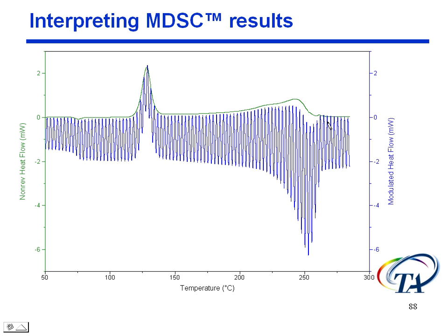All right, now what I've got here is the modulated heat flow curve and the non-reversing curve. At what point is the heating rate 0? That's at the top of this curve, right? Because that's when basically we see this is at 0 for at least part of it.